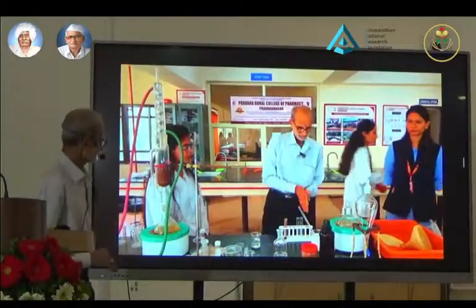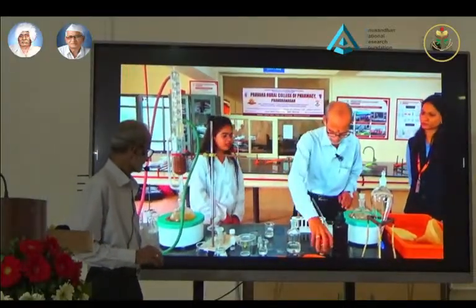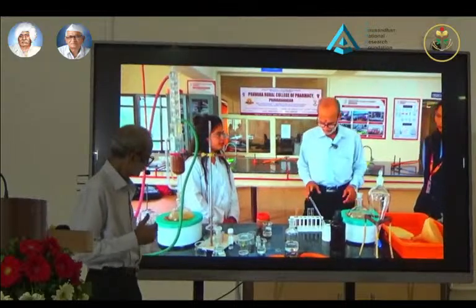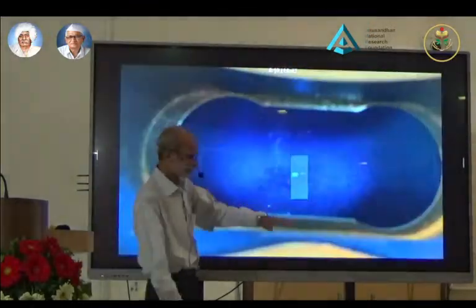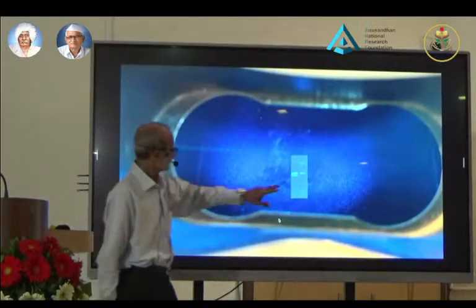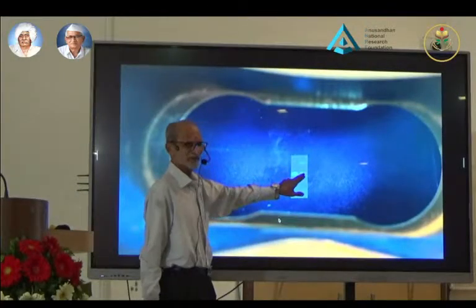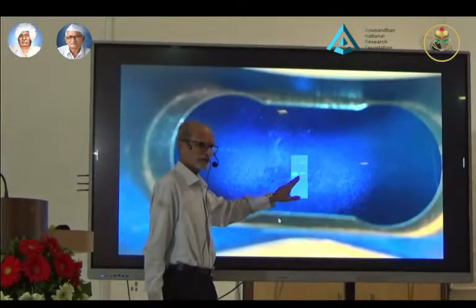Then of course the extraction was continued. Wait a minute, just go back. Here you can see clearly. This is the standard and this is the extract. It is showing the corresponding spot of quinine in the extract as well.